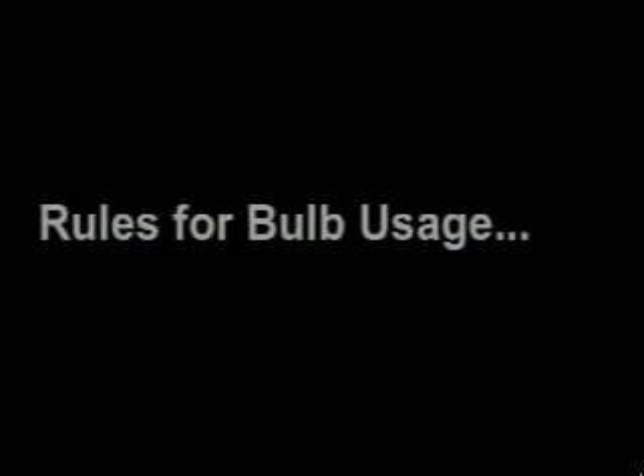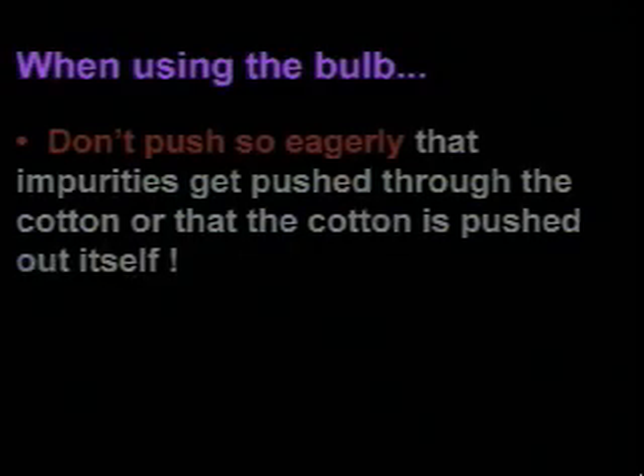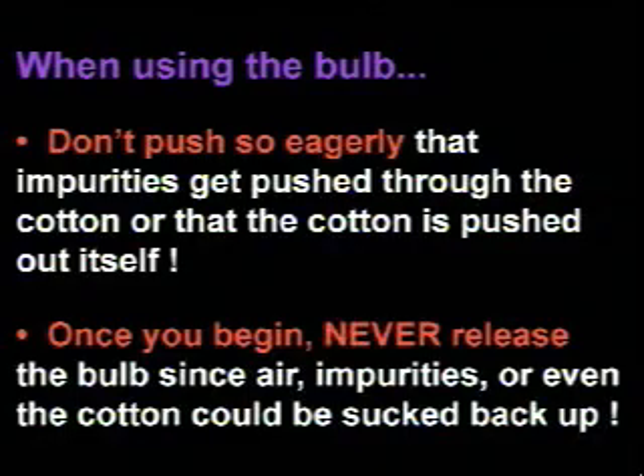If you insist on using the bulb to expedite your filtration, there are some rules for its usage. When using the bulb, don't push so eagerly that impurities get pushed through the cotton or that the cotton is pushed out itself. And once you begin, never release the bulb, since air, impurities, or even the cotton could be sucked back up.